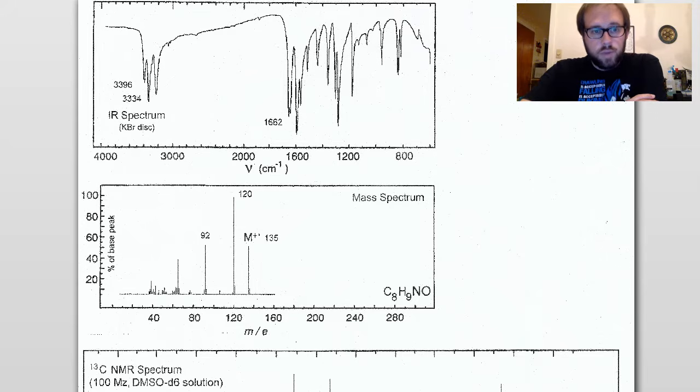So this is going to be an unknown with mass spec, IR, carbon-13, and proton NMR, just like the course taught.